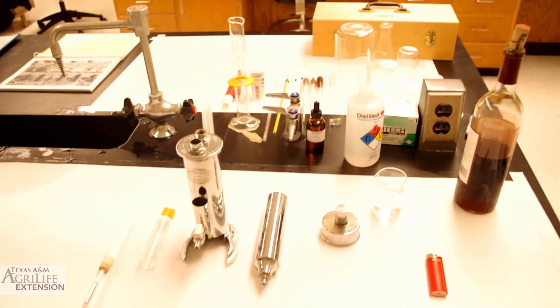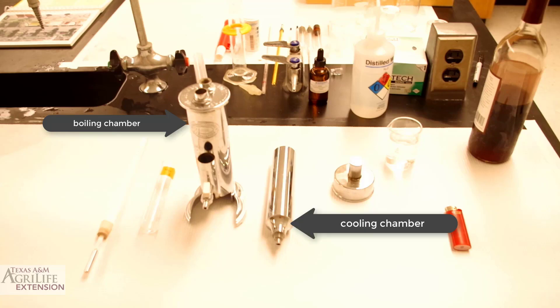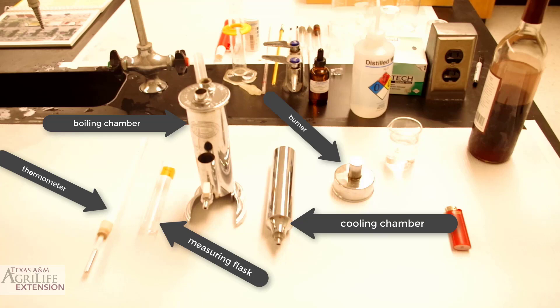Hello and welcome to our classic ebuliometry video. This is a classic Dujardin Salerand ebuliometer. It is made up of a boiling chamber, a cooling chamber, and it comes equipped with a thermometer, a burner, a measuring flask, and the calibration and results indicator dial.